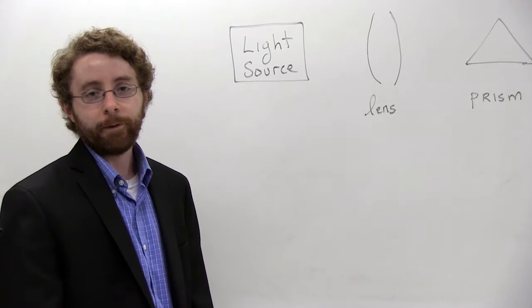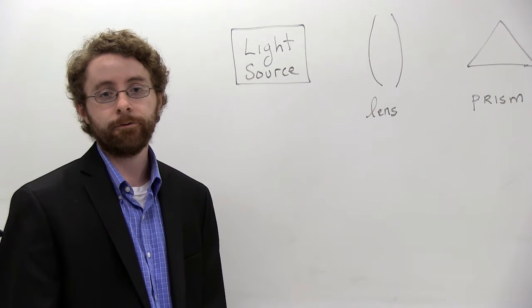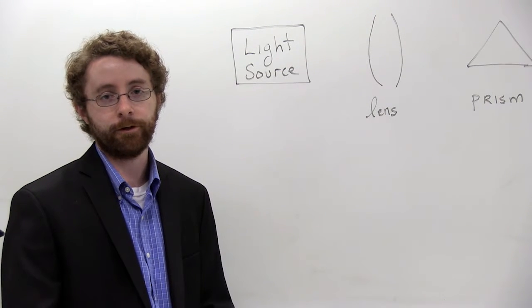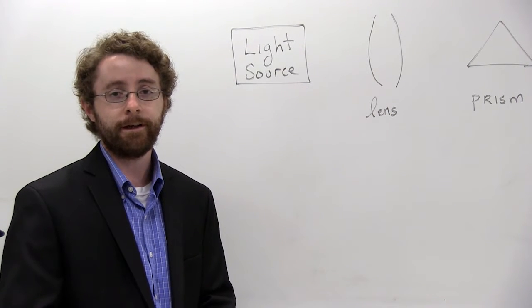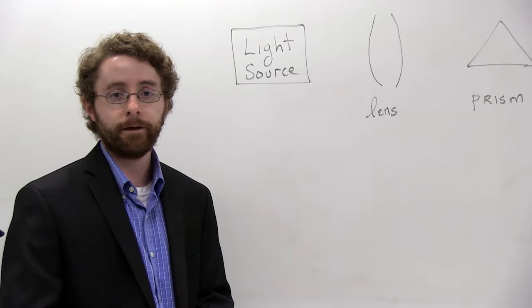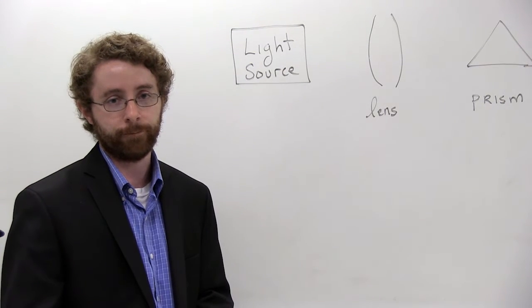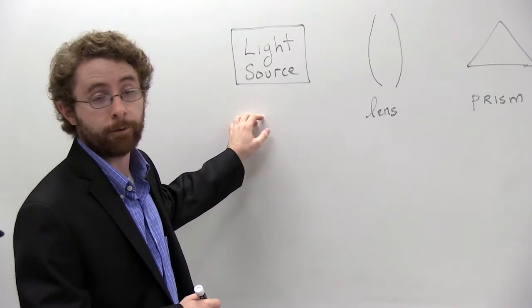In today's video, we will learn how to use a spectrophotometer. Spectrophotometers are used to measure the amount of light that passes through a given solution. This is an important concept in science because using a spectrophotometer, we can figure out the concentration of a particular solution. This diagram here shows how a spectrophotometer works.